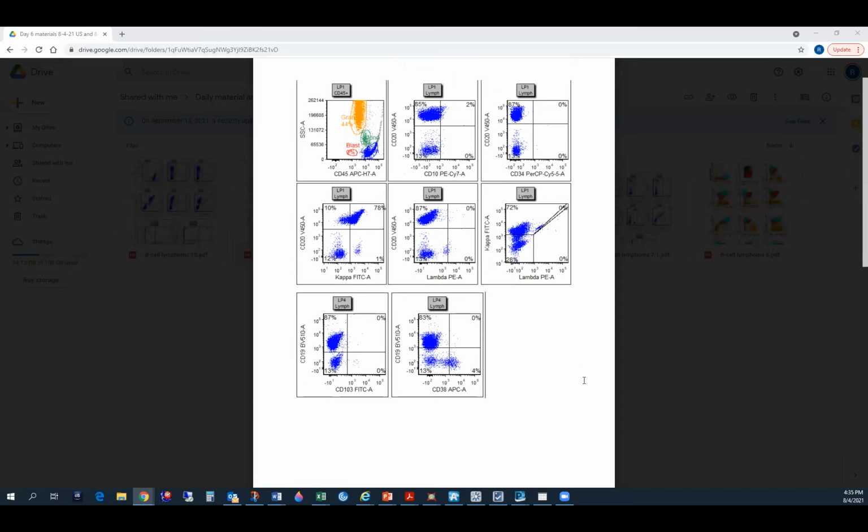Are T cells negative for 38? Yes. Right, so the T cells are here. So these are your NK cells. NK cells are 38 positive, and the plasma cell 38 is brighter than the NK cell 38. So that would be somewhere here, like plasma cell 38 would be.